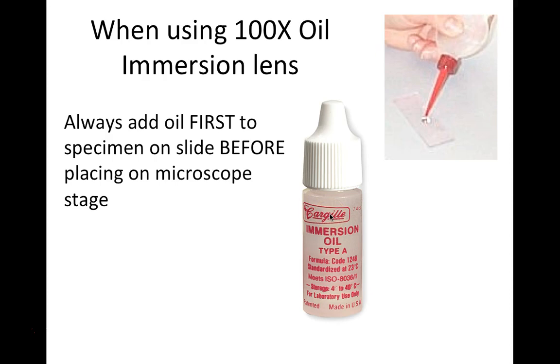If we're using the 100x objective, this is called an oil immersion lens because it is designed to only be used with immersion oil. The immersion oil goes on the microscope slide over the specimen, and the objective lens sits right in the oil, so the lens, oil, and specimen must be continuously aligned. The oil helps collect all of the light so we can see our specimen. We only use the 100x oil immersion lens on specific types of specimens and only when instructed.